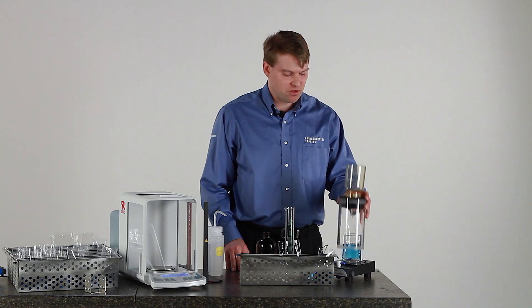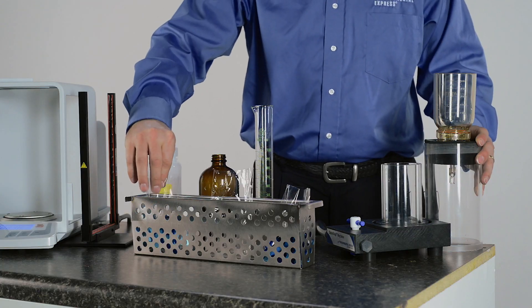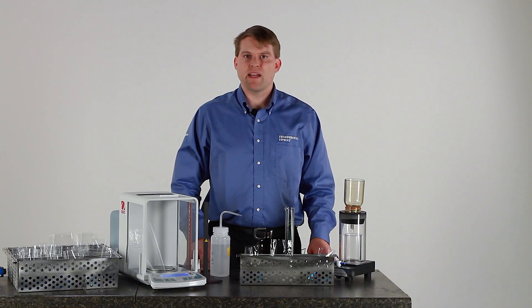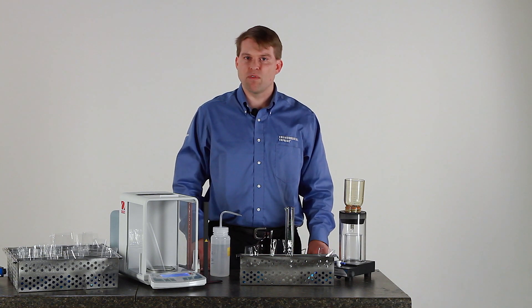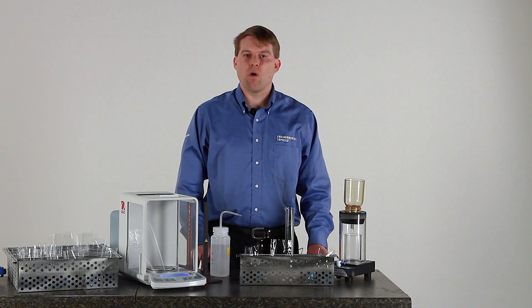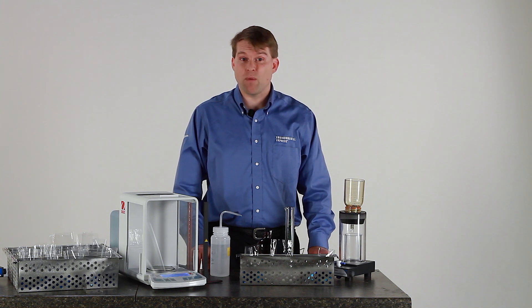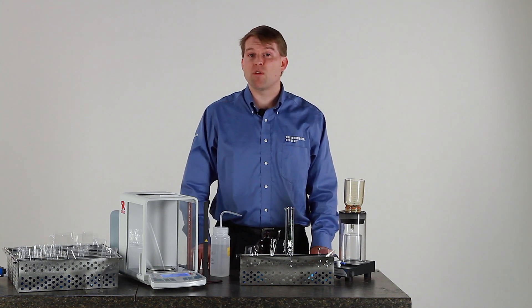Once your sample has finished filtering, remove the vessel from the filling station and transfer it to the oven rack. Once you have completed all of your samples, move the entire rack with your filled vessels into a drying oven or a water bath to evaporate the water off of the samples. After the water has been evaporated, the rack will then transfer into a 180 degree oven for a minimum of one hour. This ensures that all residual water crystallization has been removed from your sample residue.